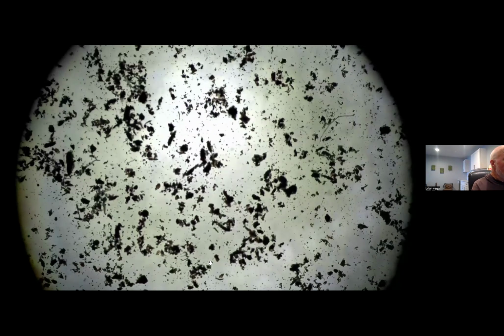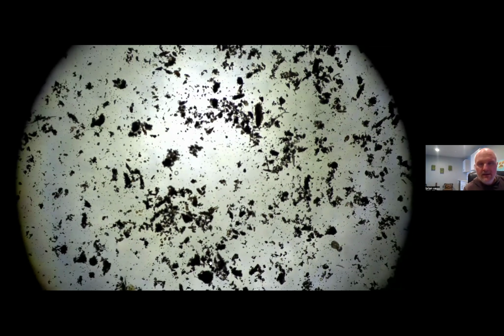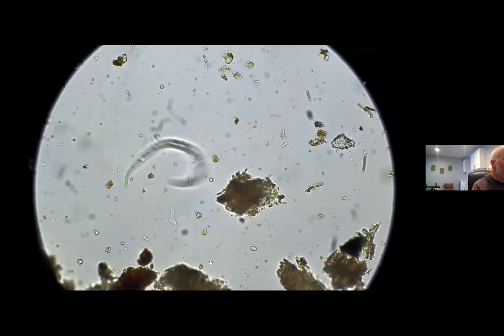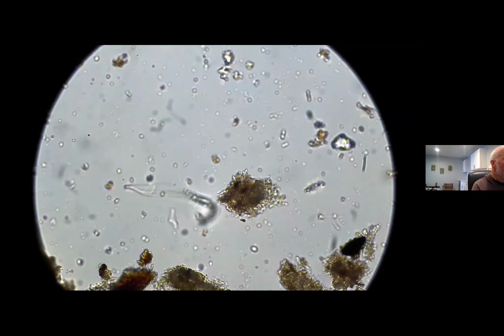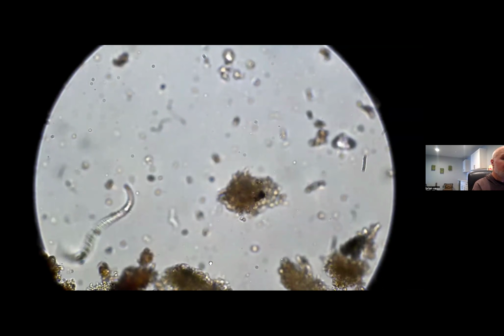And so when I start scanning through the slide here, I'm looking to say, hey, is there something I want to be able to take a look at? And hey, I see something on my screen. And I'm sure you guys might be able to start to see it. See that little wiggling thing right there? That's a nematode. And so I'm going to go ahead and zoom on in, and we're going to go find that nematode. So right now I'm at a 400x total magnification. And this little guy is moving all over the place. Is it coming across all right for you guys?